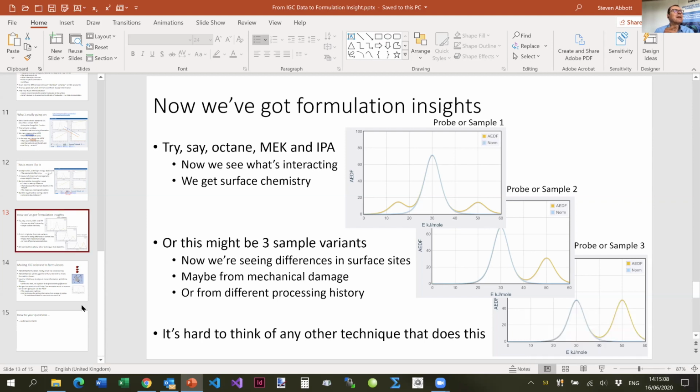There's one question about alkanes showing dispersive HSP is dominating. So why is the dispersive part of the HSP values dominating? Is there any reason here? Yes, the universe is mostly held together by dispersive forces. So the fact that octane doesn't evaporate is because every molecule on the planet has quite a distinct dispersive interaction.